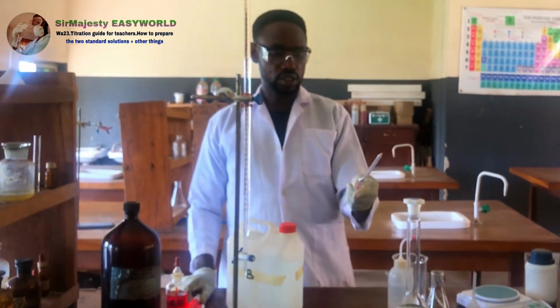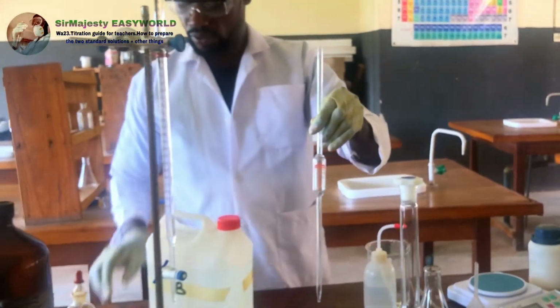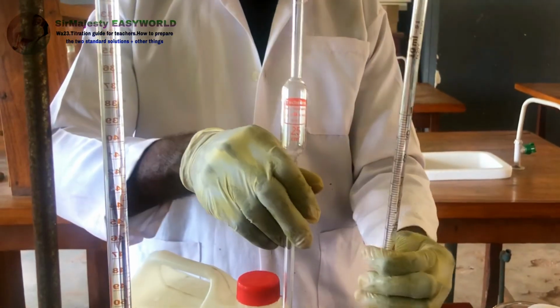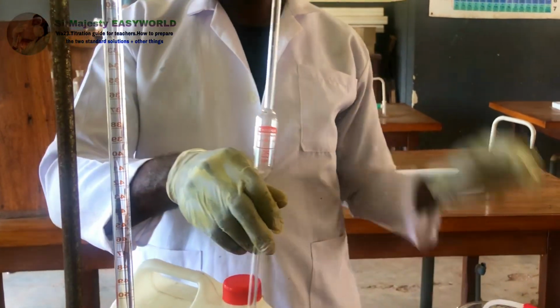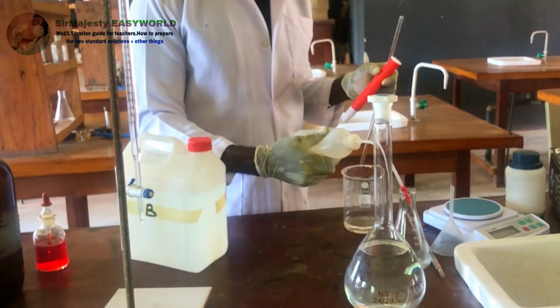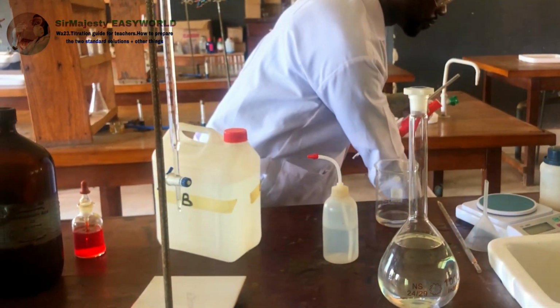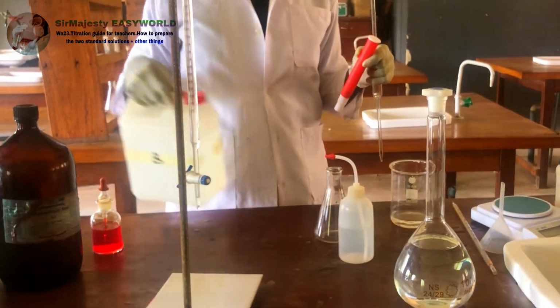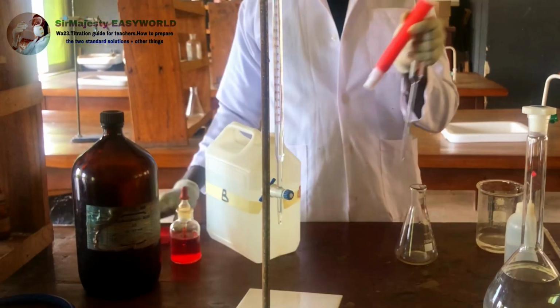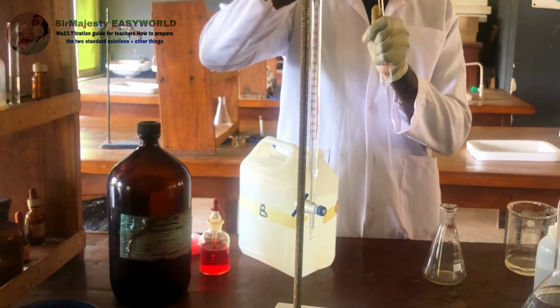So here is the 25 ml volumetric pipette. But this one I used is a graduated pipette. Okay, then this is the conical flask. You rinse it properly. Okay, it's time now to get our base. I don't want to pour it out because I have this to pipette it exactly.